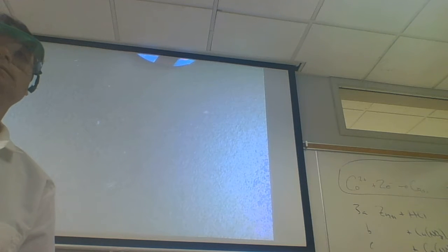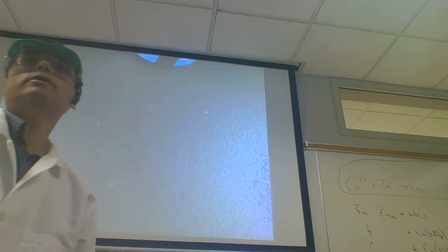This is probably easiest if you guys did this. Oh, it's turning green. Well, what happened to the blue color? It disappeared completely. Now that blue color disappeared and I got a kind of a black precipitate. And now the blue color is being replaced by a red pink color. Or kind of a purple color. Yeah. And then there's a black precipitate on the bottom. Yeah, it's kind of like blood or blue blood.